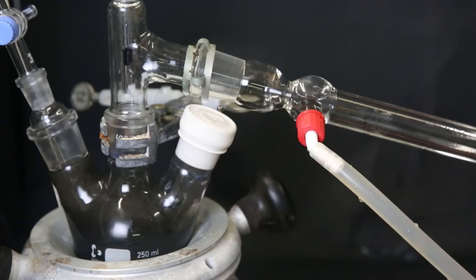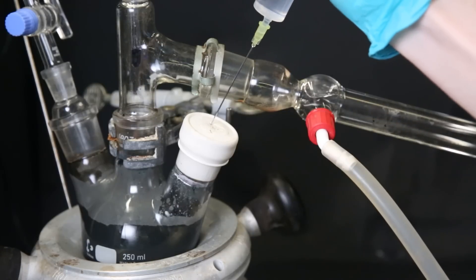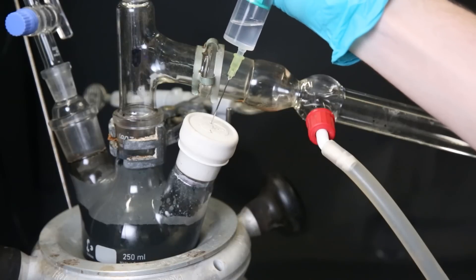In literature, they mention boiling off all of the solvent and then taking up the cobaltocene into hexane and crystallizing from there. But it didn't really work out, and honestly, I just need a cold finger to properly purify it.